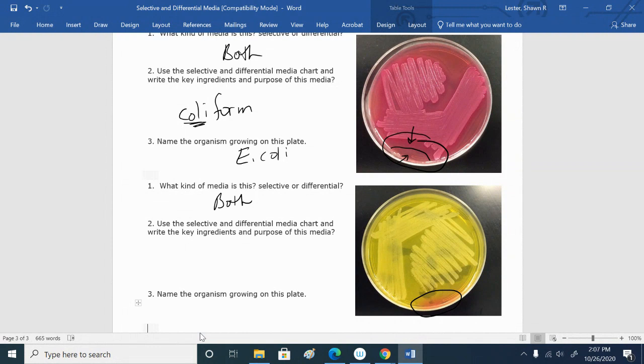In particular, Staph epidermidis, because they're the two most common types of staph that people have on their skin, with epidermidis being the most common, followed by Staph aureus. And then there's some other miscellaneous ones that people might have. But it's mostly epidermidis and aureus. And so we want to know, which kind do you have?